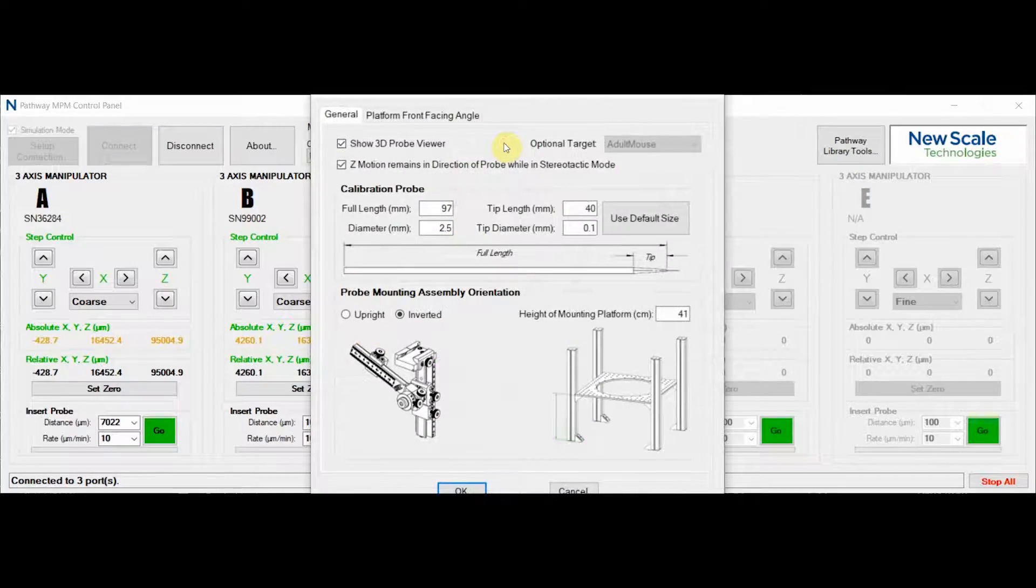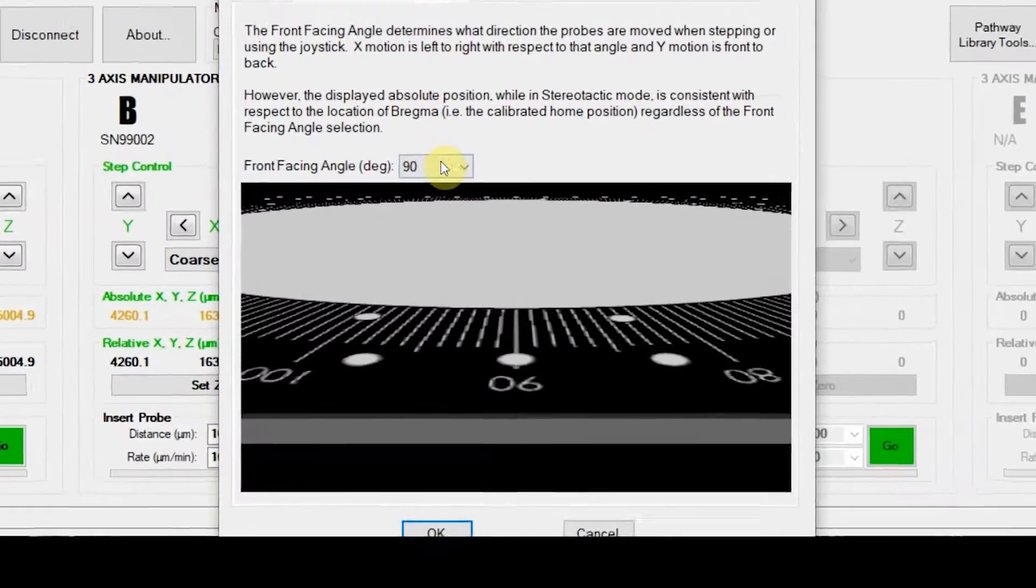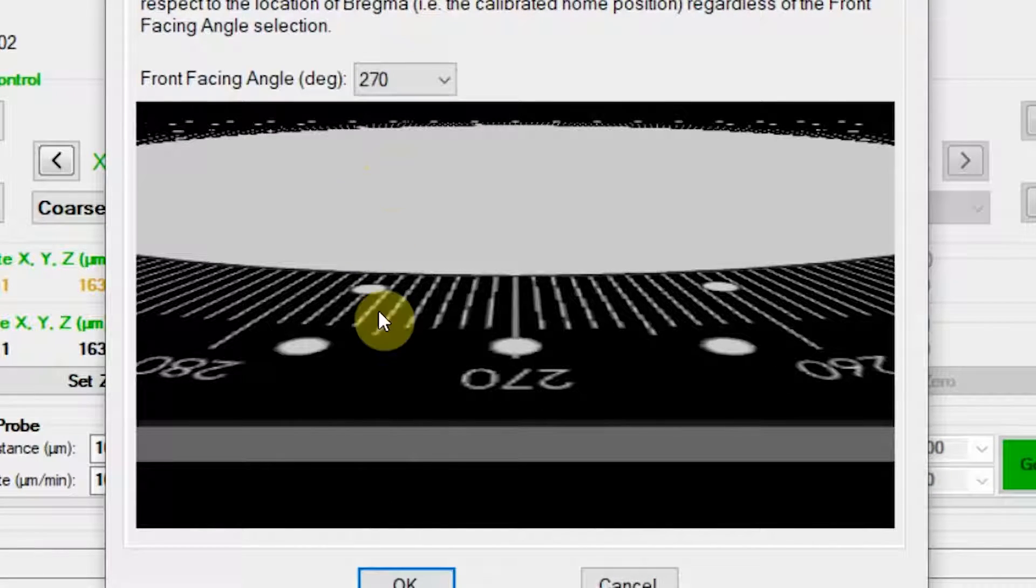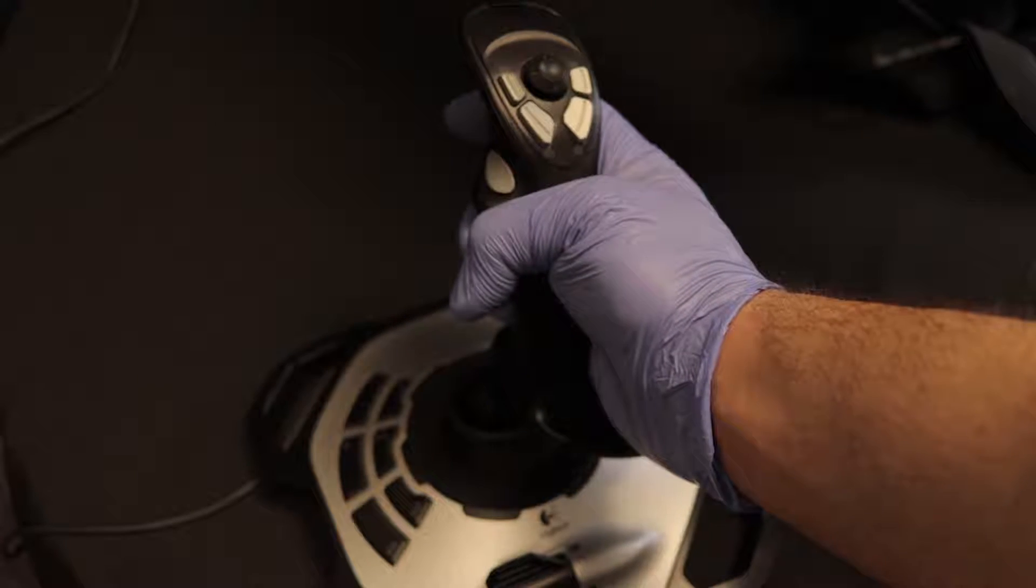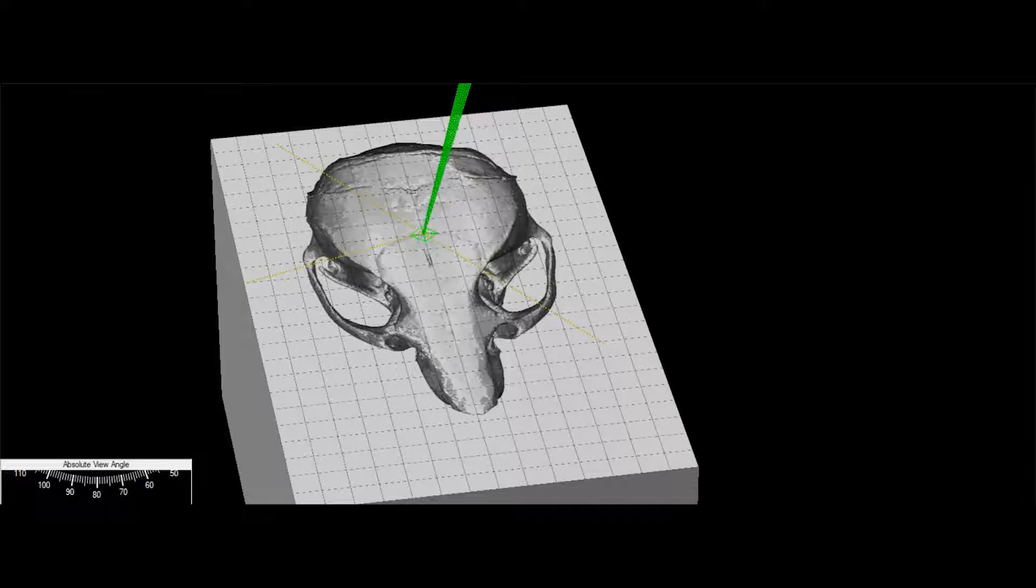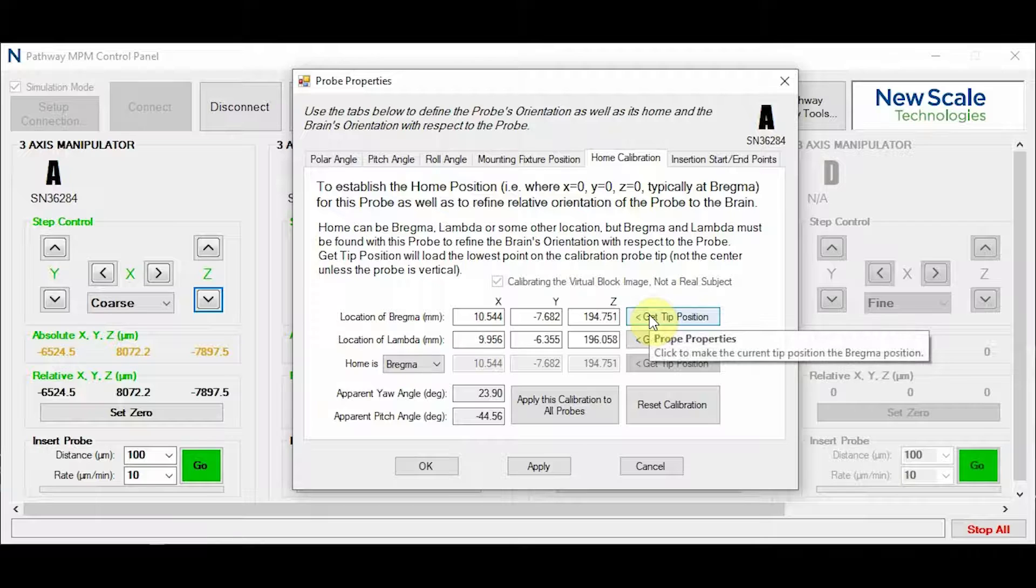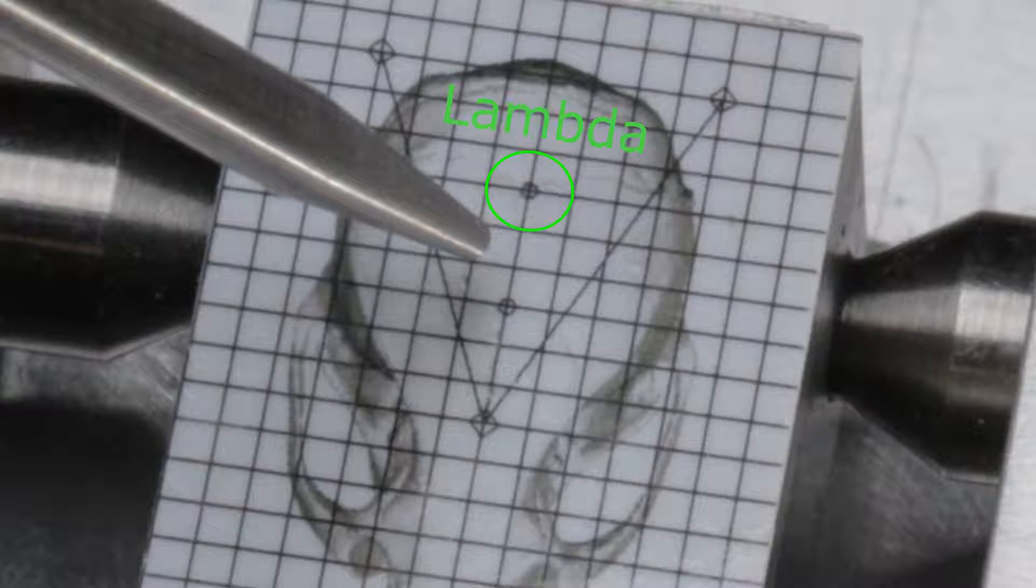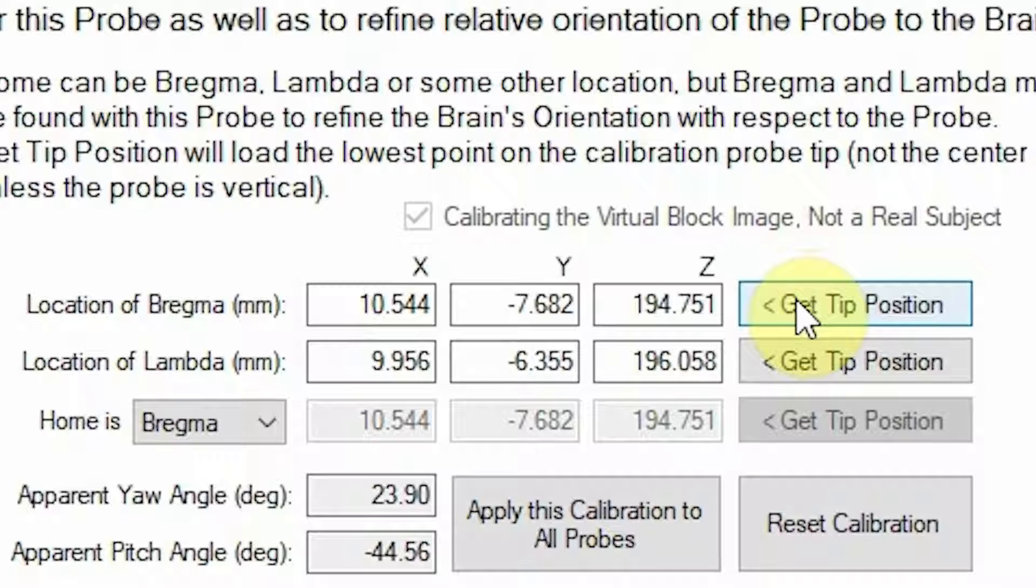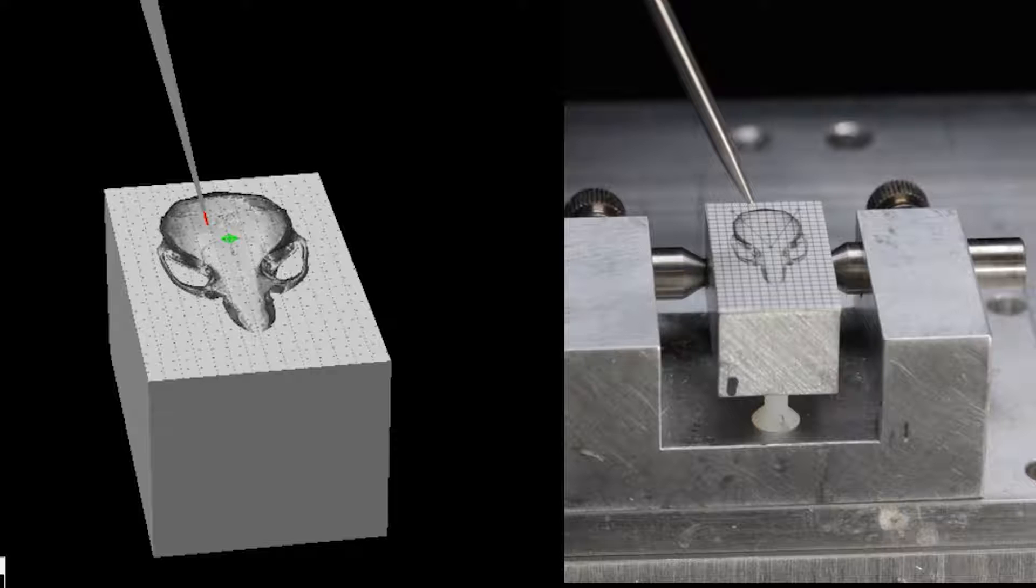Calibration of the axes is quick and simple. First, set your front-facing angle to tell the software from which direction you are viewing your NPM system. Then, to set a zero point, probe A is moved until it just touches Bregma. This point is captured and then the same process is done for Lambda. Once these two points are captured, the orientation of the virtual setup will correct itself to match the orientation of the physical setup.